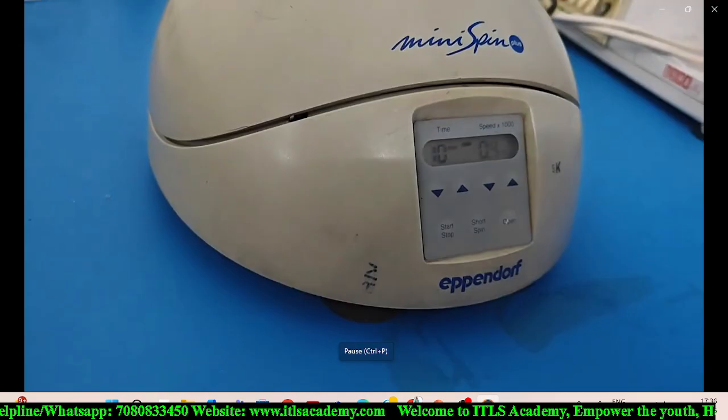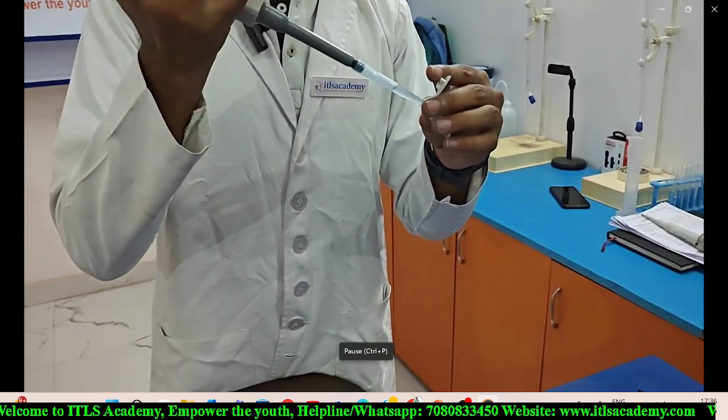So friends, after performing the centrifugation, now we have taken it out from the centrifuge. What we are going to do now, we need to discard the supernatant and we take further pellets. Remember that the pellet should not be disturbed while you discard the supernatant.